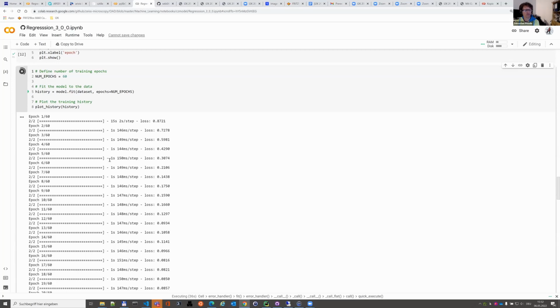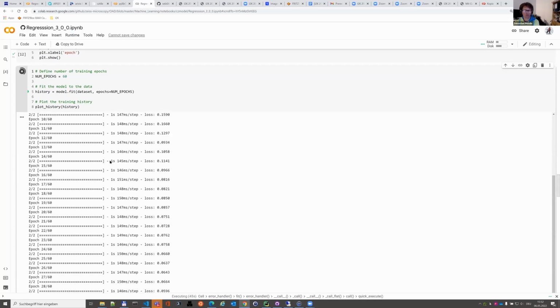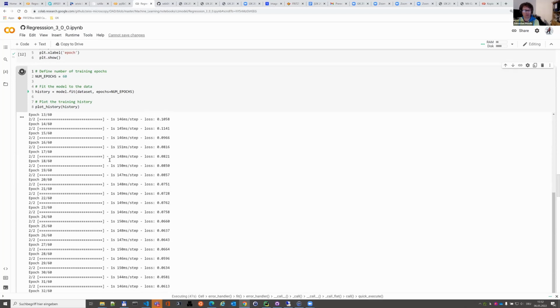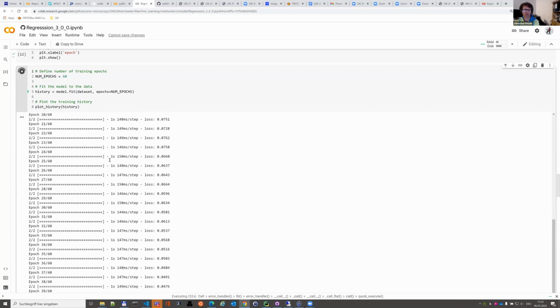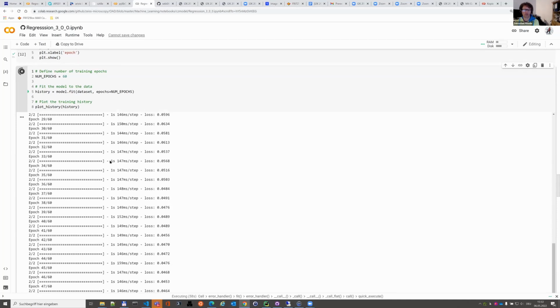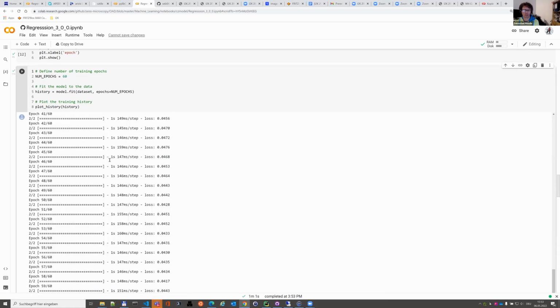So here, why I show this to you is you might want to train your own magic AI function that transforms the image or does some better denoising or whatsoever. You can train it in your Jupyter notebook and still provide it to your users. Now I'm assuming that at least some of you will be working in imaging facilities. You can provide it to your users by just handing them over the CZANN and say, use it in your ZEN software. That would work easily.